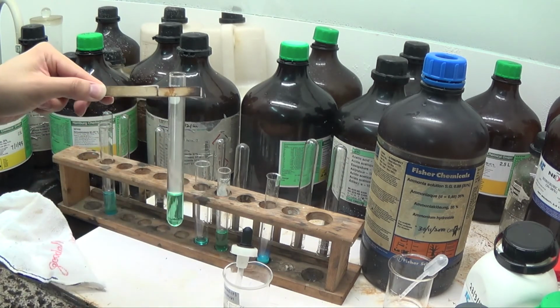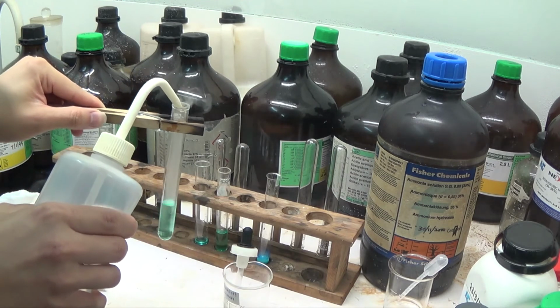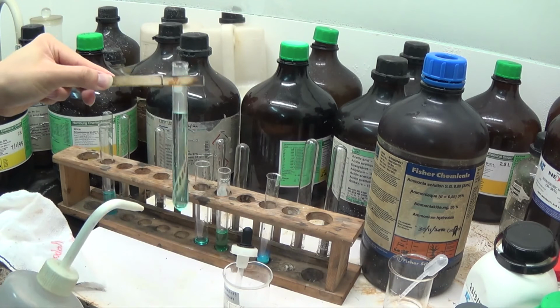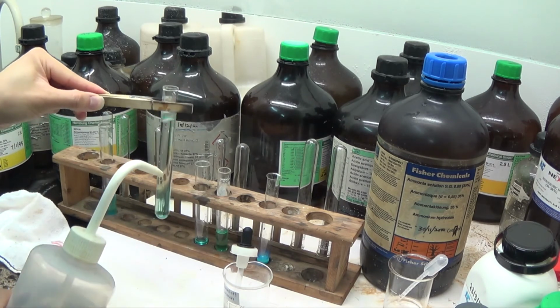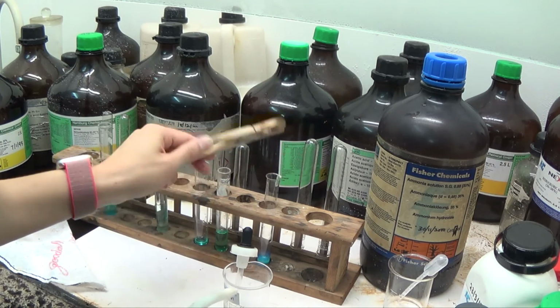So what happened to this reversible reaction is this is the green colored thing. If I add more water to it, water can compete as a ligand, and as you could see, it's a very pale blue solution now because it's gone back to the copper 2 plus surrounded by 6 H2O molecules. Okay, just like this one was in the ammonia.